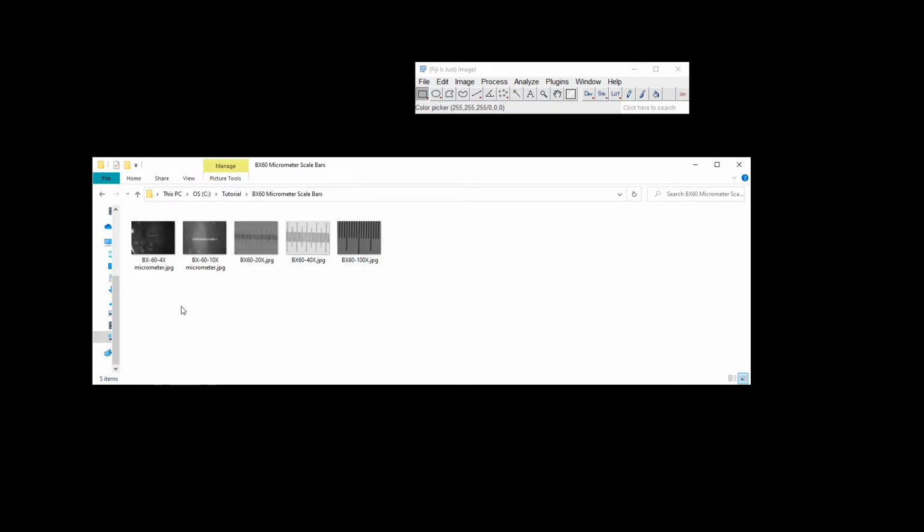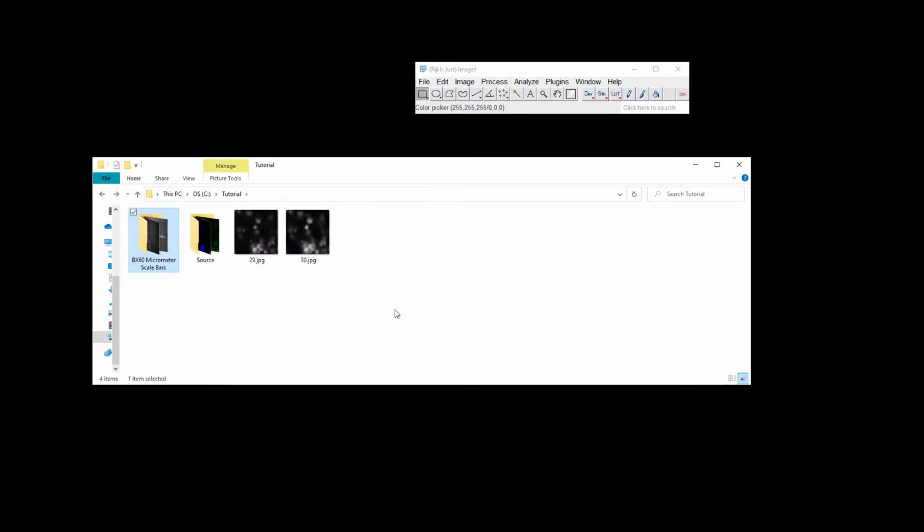So these images were taken by the microscope by their individual models, and essentially we will be using that as a reference for the conversion from units as pixels to units as microns. So that I will include with the email that I send out later the layout of the microscope room, so that in case you forget what model to use for the scale bars.